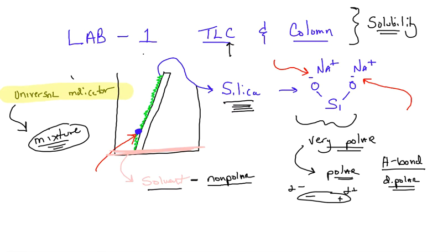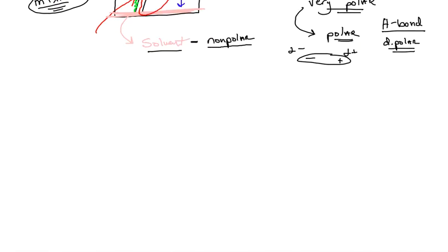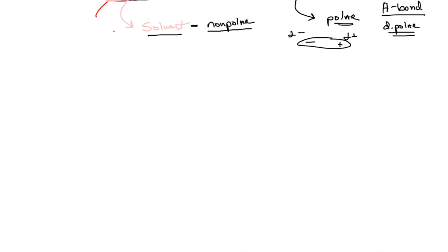See, the nonpolar solvent is going to be pushed and pulled up the plate by capillary action. Now we have atmospheric pressure pushing down on the liquid, and we also have some attractive forces that are pulling some of the solvent along. Now in the solvent, party people, we have two things. We have hexanes. Now, what are hexanes?